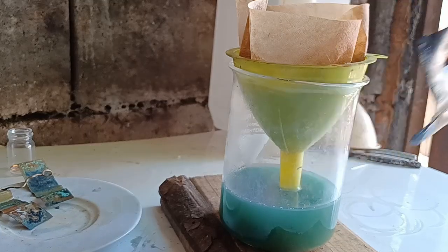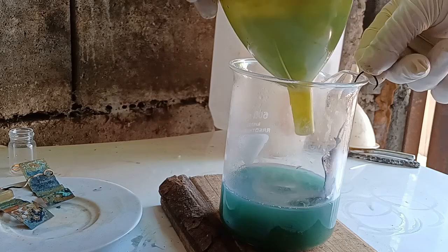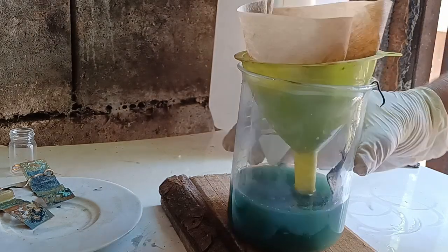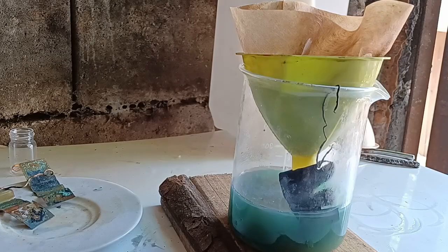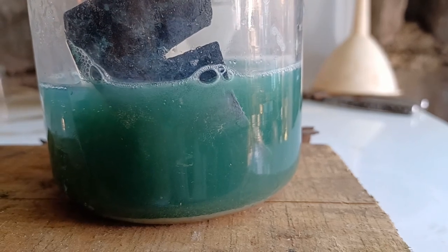After confirming that this time there was some silver in the solution, I added a piece of copper to cement it out. It took some time for the reaction to get going, which tells me there isn't a lot of silver.